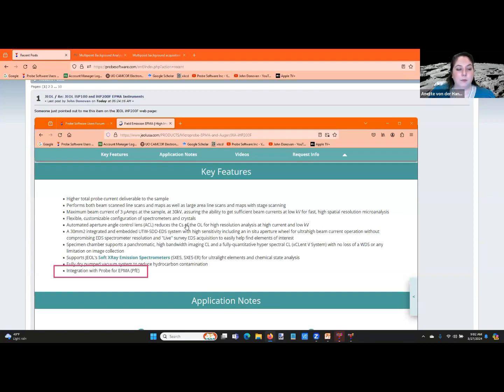But yeah, it helps to have software that records all the nitty-gritty details so that I can look at it again. Also, I really like it as a lab manager because of all these intensities that I can look at to see drift in the machine over years back, with just a small utility that harvests that, instead of, I don't know, having to type it out all the time. So there are also some aspects when it comes to quality control that are kind of nice.